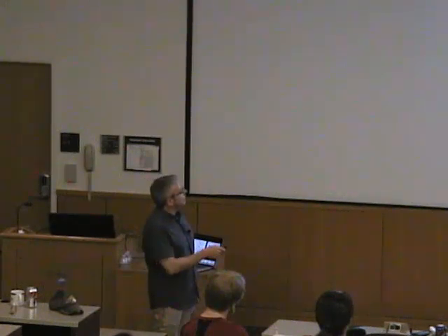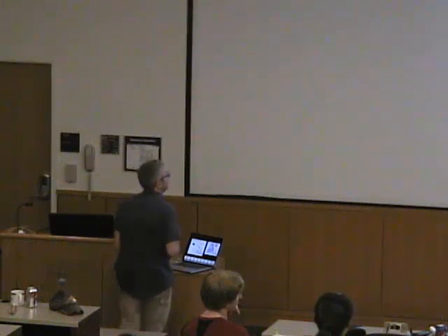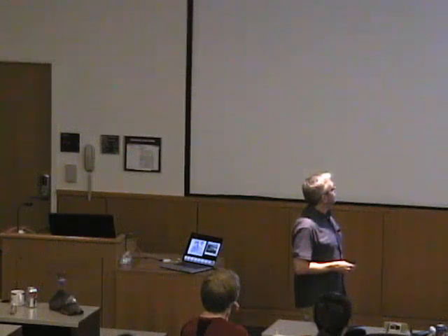So this is the Patterson map for the ferredoxin that we are solving in the practical, and you see there are peaks that even give you a hint of how an iron-sulfur cluster looks. You even get some signal for the sulfurs. So this is where that thing is. This is the kind of information that we need to get substructures that then solve our real structures. And then the Fourier transform is calculated, and the magic happens, and you end up with something like this.